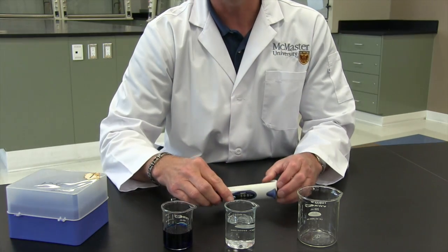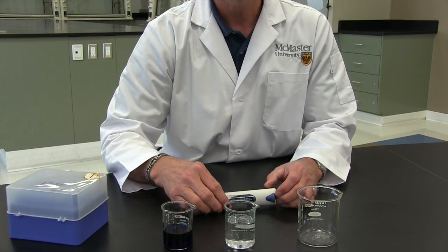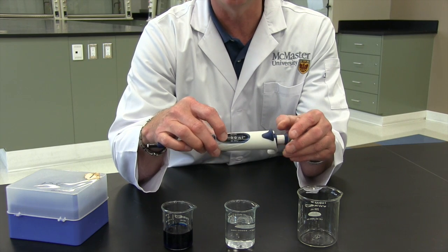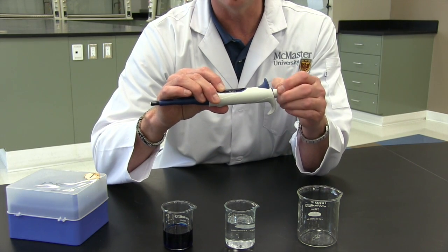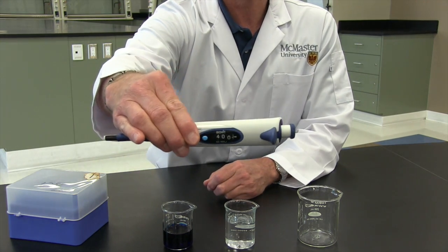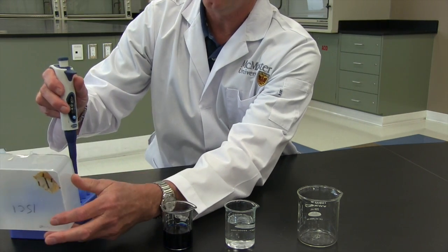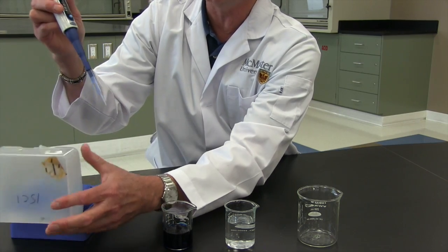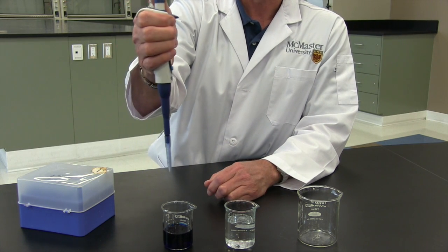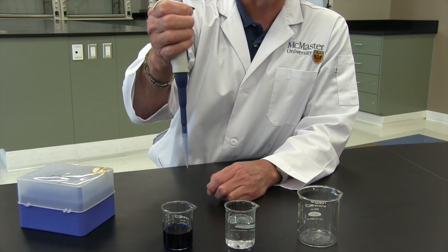If I want to dispense 400 microliters of this blue liquid into this beaker, the first thing I need to do is set my pipette to 400 microliters by pressing in the lock button, changing the volume to 400 microliters, releasing the lock. Now I'm going to get a tip by opening my tip box, pressing down gently but firmly till I have a tip and closing the lid again. I'll hold it in my hand, wrap around.